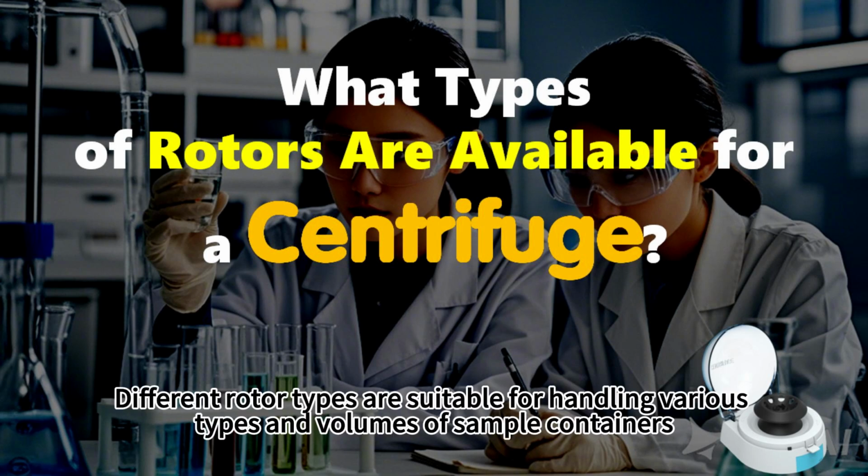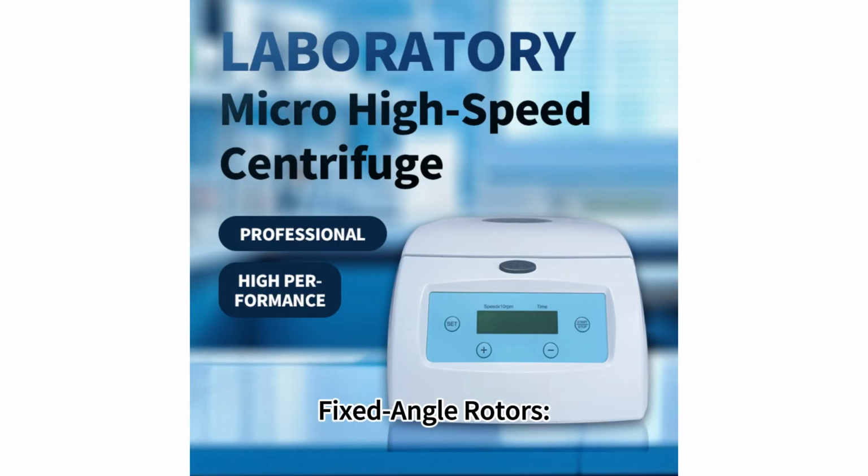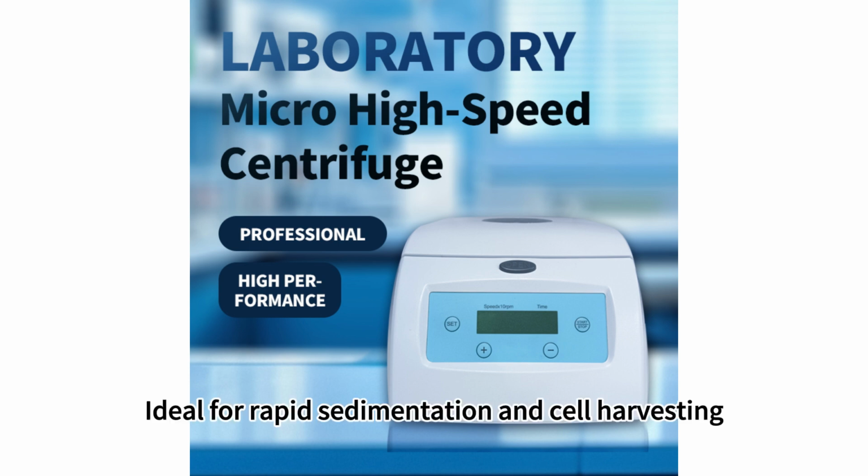Different rotor types are suitable for handling various types and volumes of sample containers. Types of rotors: fixed angle rotors. Description: samples are held at a fixed angle to the axis of rotation. Use: ideal for rapid sedimentation and cell harvesting.